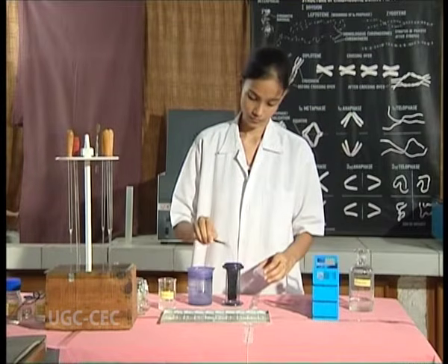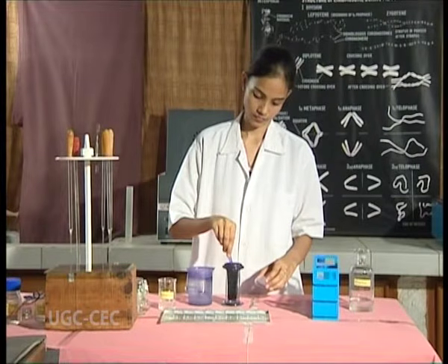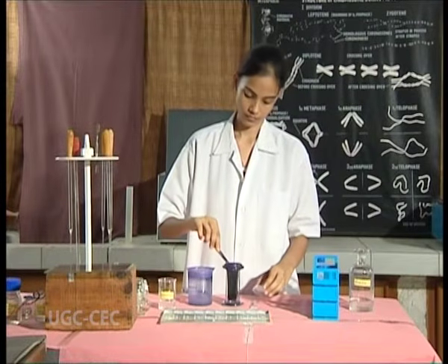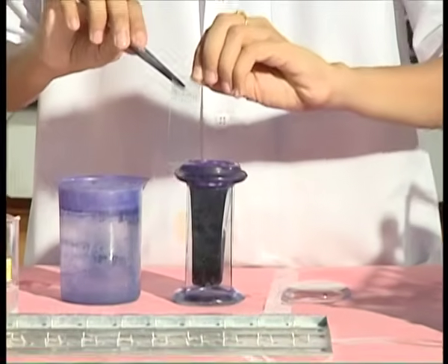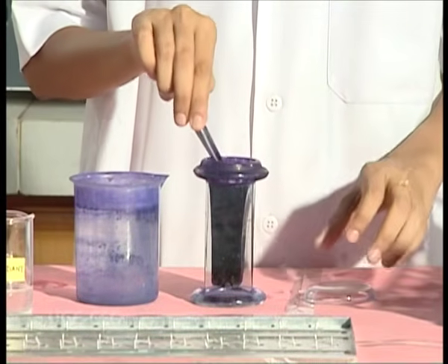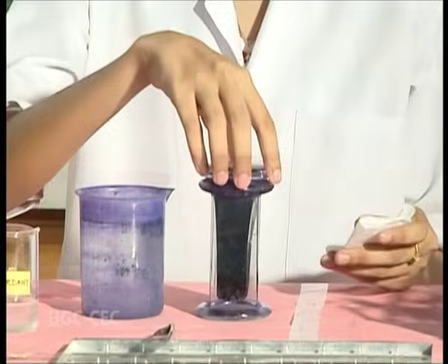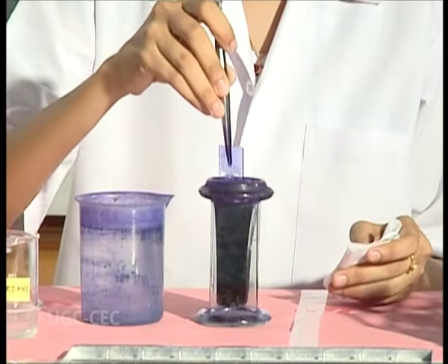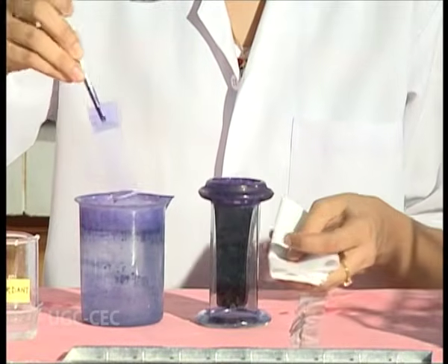Now keep them in 2% Giemsa for 3 to 5 minutes. Rinse in distilled water.